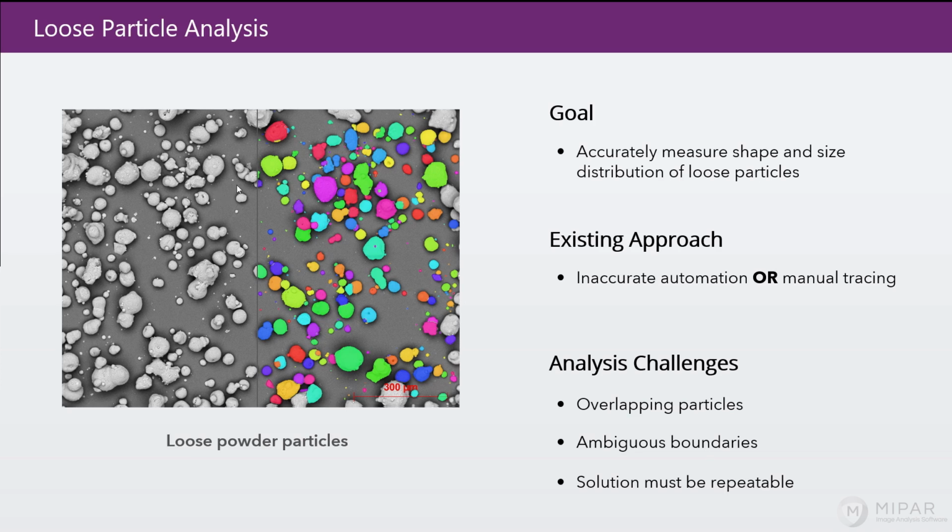In fact, many researchers have looked to switch from traditional laser-based approaches to size measurement of powder particles because of the concern with agglomeration, where particles that are stuck together are seen as one complete unit rather than the size of the individual particles being accurately measured.